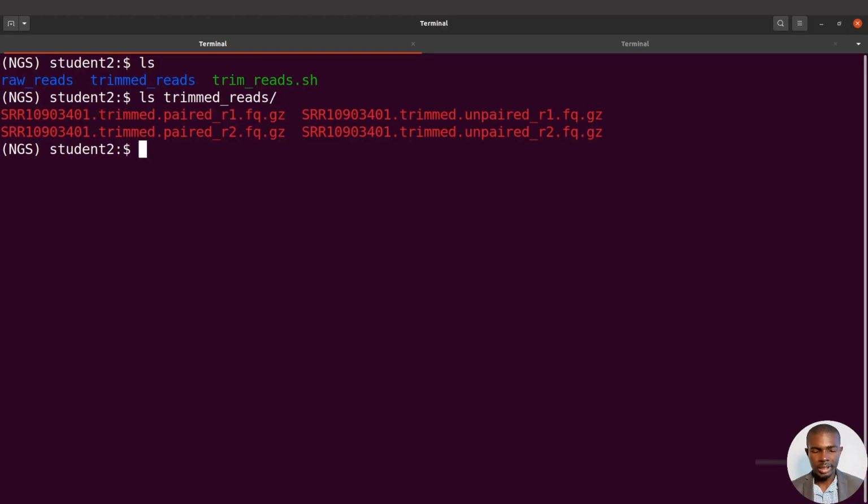All right, we are on the terminal now, so everything looks good. We are going to map the reads, which is this one and this one. Those are the ones we are going to use. We are going to map them to the human reference sequence, hg38. We are going to use BWA, but we don't have the reference sequence here, so we need to also download that. So let's go to the page which has the file.